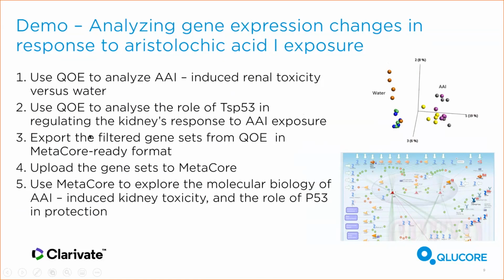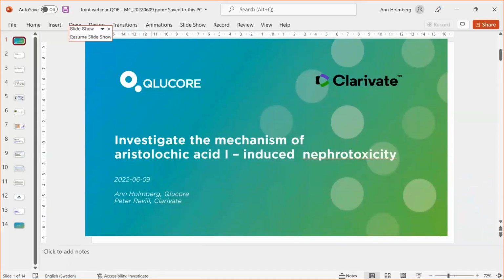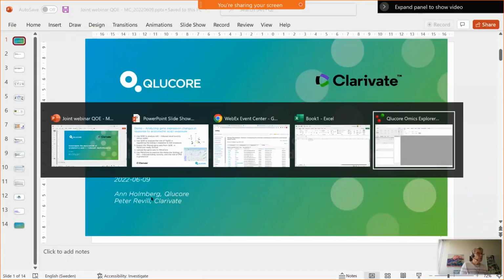And then we will export our genes of interest in lists in MetaCore ready format for upload to MetaCore, and then we will move over to MetaCore and Peter will explore the underlying biology here. So let's move to the software.